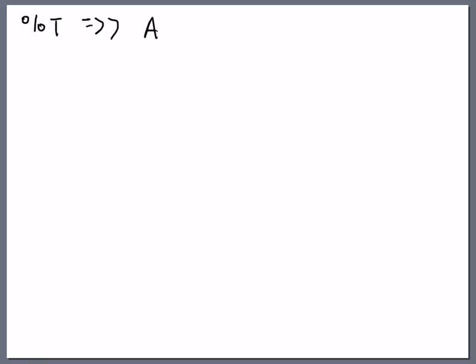Okay, so we said that there was a working range, and the working range for absorbance was around 0.1 to 1.5 ABS. Anything lower or higher doesn't quite work. We don't feel good about the measurements and the samples we are putting into the instrument. If it's lower than 0.1, it could be so low that the machine has a really hard time picking up the differences. And if it's higher than 1.5, the same thing can happen.